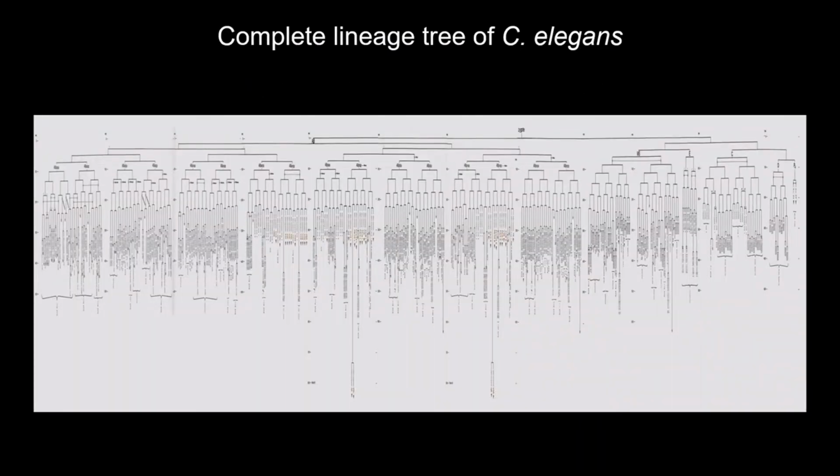So the tracking results can be used to generate this kind of lineage trees. And the important point is that the tracking results need to be error-free to do this analysis, because only minor mistakes can change the structure of these lineage trees dramatically. So it is important to have the tracking system that allows the users to inspect and proofread the results in an efficient way.